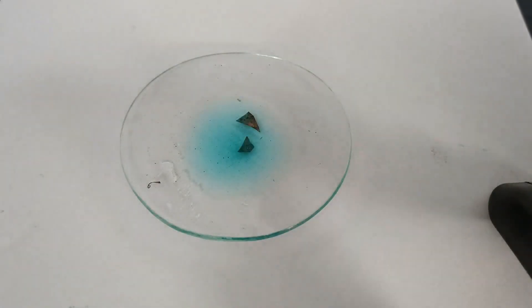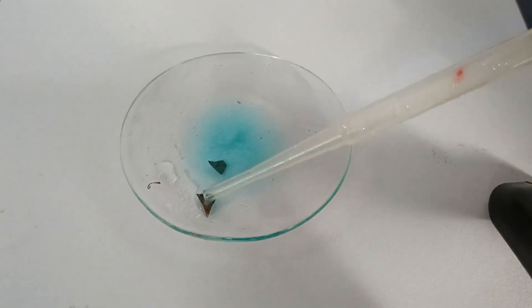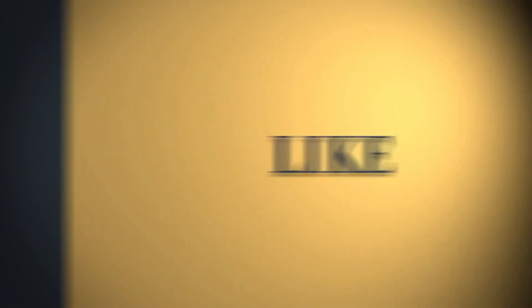The end products of the reaction are water, cupric nitrate which is blue in color, and nitrogen dioxide gas which is reddish brown in color. I hope this experiment was helpful. Thank you very much for watching the video.